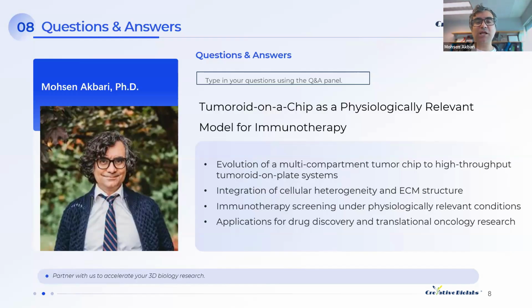The approach we are following is that we look at the genomic, proteomic, and metabolomic profile of our platform. We receive the cells, we look at their mutations, see what mutations are present in the cells we received, and then compare that with the original tissue that we obtained.